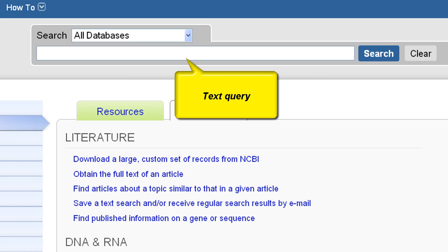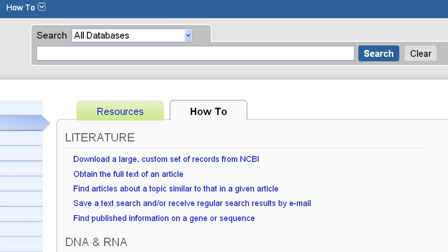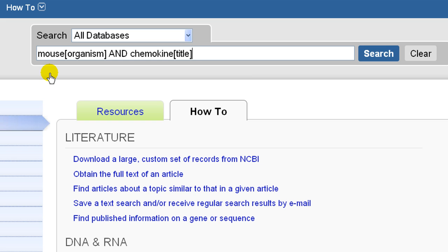The first approach uses a text query and the second uses Batch Entrez with a list of UIDs or unique identifiers, such as accession numbers, GI numbers, or gene IDs. Let's use a text query to find mouse mRNAs that have the word chemokine in the title of the record. I'll enter mouse organism and chemokine title in the search box. I could select a specific database, but let's use Entrez's global query.